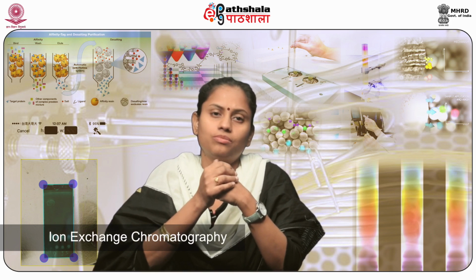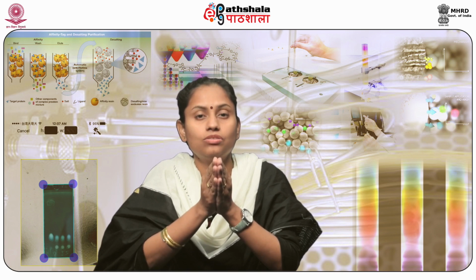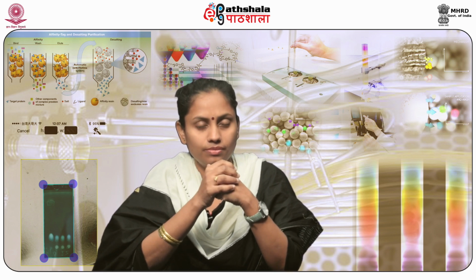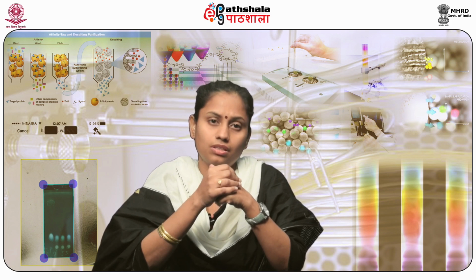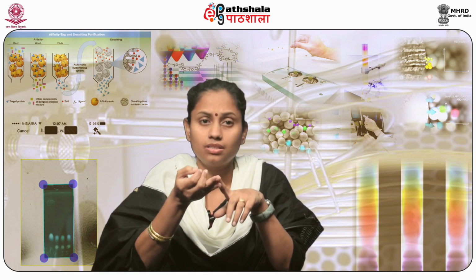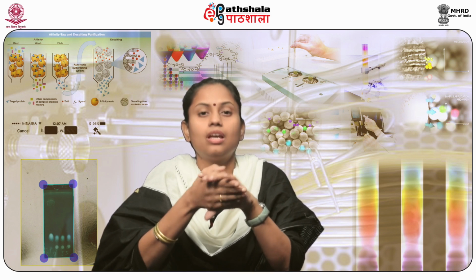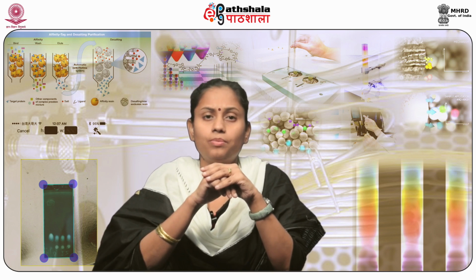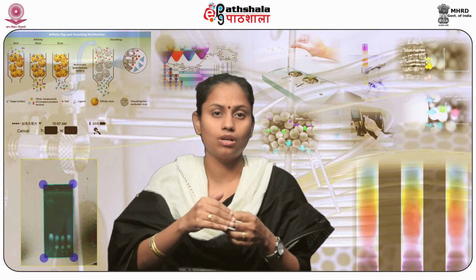So what is ion exchange chromatography? Ion exchange chromatography is a type of chromatographic technique where the separation of compounds is on the basis of the net surface charge of the molecule. This technique was introduced way back in the 1960s and is still very sought after for the purification of proteins, peptides, nucleic acids and other charged biomolecules. In this technique, the stationary phase is usually a resin. Molecules possessing the opposite charge as the resin will bind very tightly to the resin, whereas molecules having the same charge as the resin will flow through the column and elute out first.